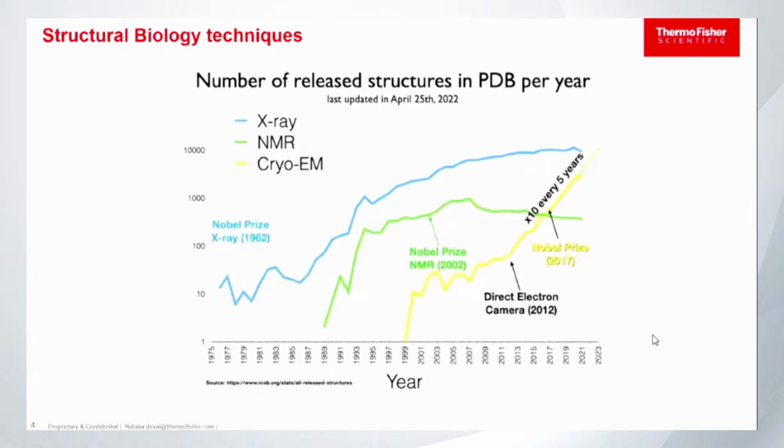Right now, if you go to the EMDB or the PDB, you can already see plenty of entries of new proteins, mostly small proteins or membrane proteins, coming from cryo-EM single particle analysis. So again, it is a very important technique for structural biology.